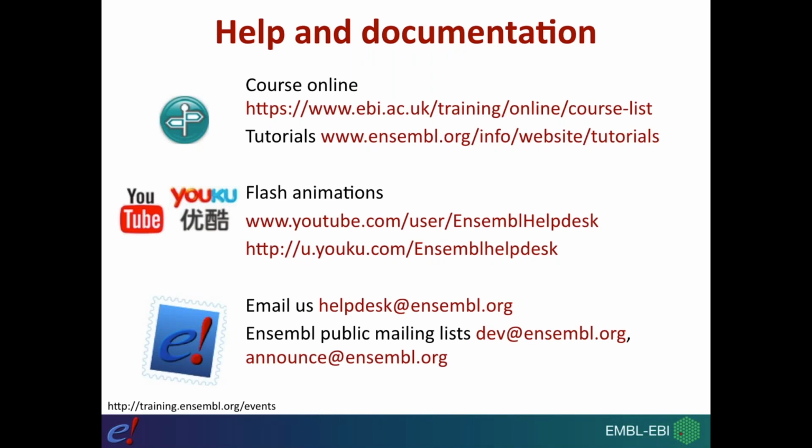If you want further help and documentation for using both the Ensembl Rapid Release Genome Browser, but also the Ensembl and Ensembl Genomes Genome Browser as well, then you can use the EBI online courses that you can find in the link here. We also have a number of YouTube tutorials and Youku. We upload our tutorials to Youku as well for those people who are unable to access YouTube. You can find lots of recorded webinars, presentations, tutorials for learning how to use different data types and different interfaces and tools within Ensembl.